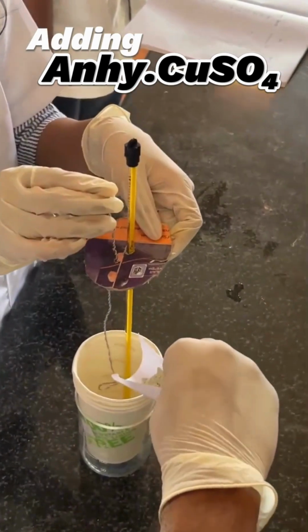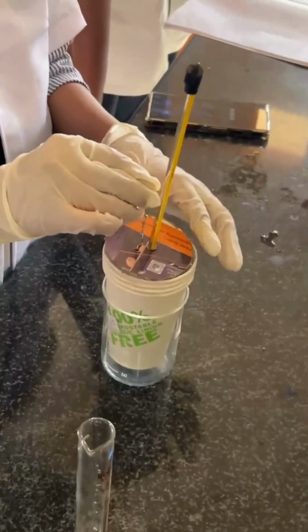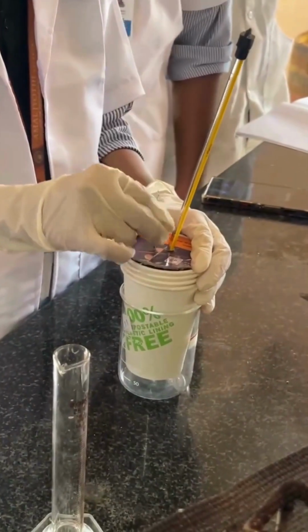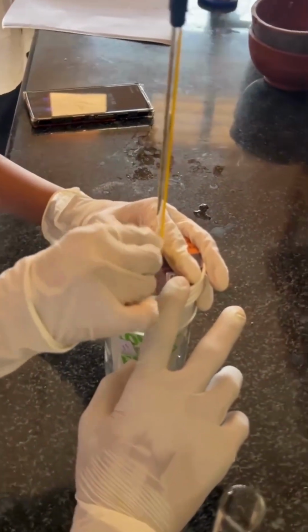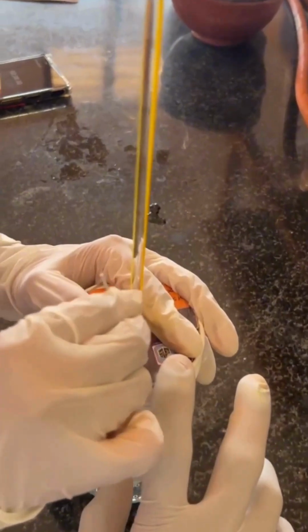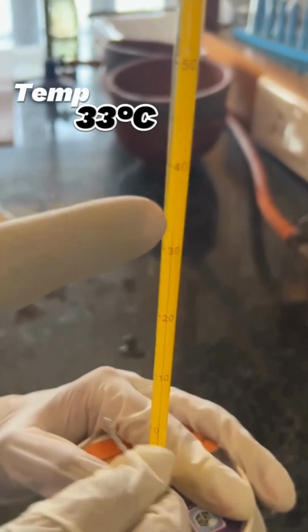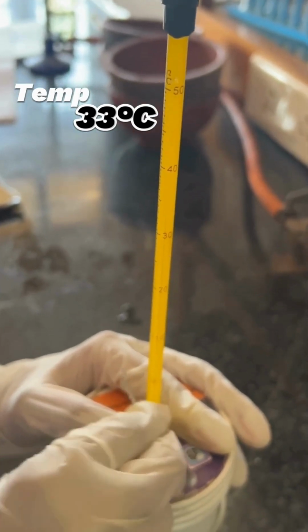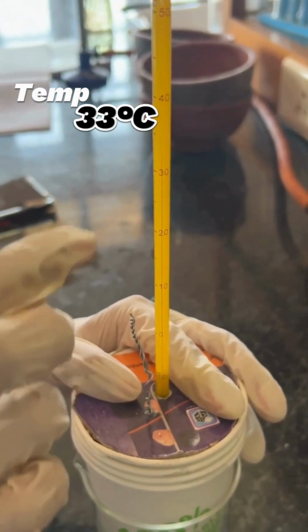We now add the anhydrous copper sulfate to the water in the calorimeter and continue stirring consistently. We monitor the temperature at the 4th and 5th minute marks. The temperature rises to 33 degrees Celsius. This increase confirms an exothermic reaction where heat is released into the solution.